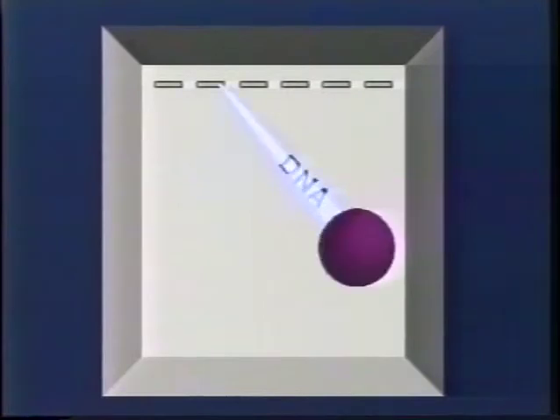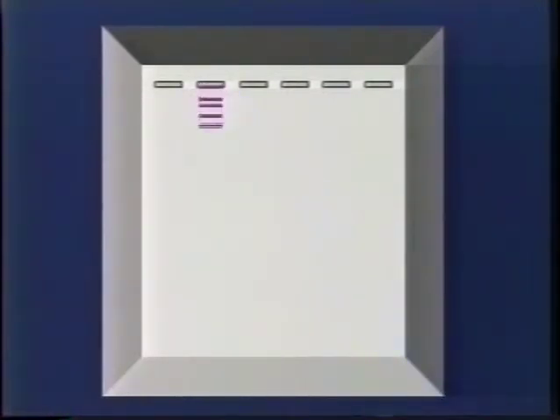These experiments begin by running fragments of DNA precisely cut by restriction enzymes. These fragments are of known length and are called marker DNA. A marker DNA allows you to plot a reference curve based on the known lengths of the marker fragments and their distances of migration during the run. Points for the curve are determined by the known base pair lengths of the marker fragments plotted against the distance run in millimeters.